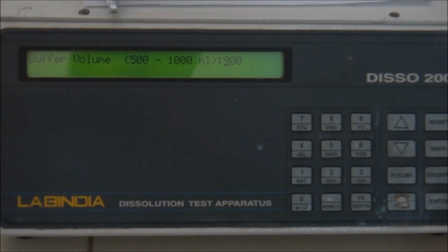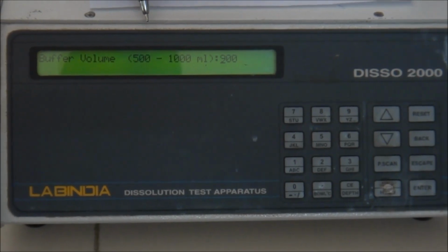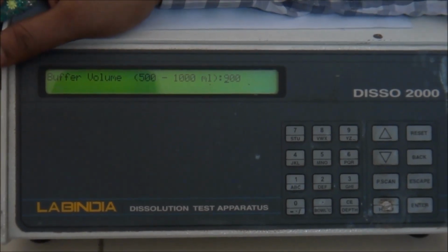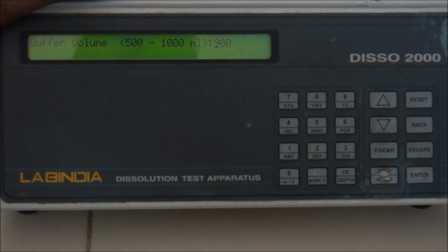Now it's asking for buffer volume. As we have discussed, the volume can vary from 500 to 1000 ml in a closed basket system, and the most commonly used volume is 900 ml. And you can ask me whether 900 is a fixed volume. No. 900 ml is not at all a fixed volume.